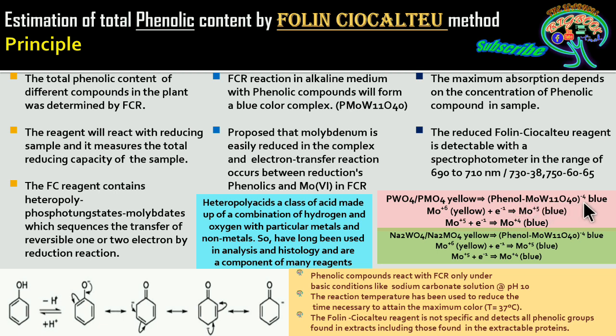In this, the molybdenum is going to transfer the electron to give the blue color to the reducing component or the sample. Now further, it is also the sodium tungstate and sodium molybdenum complex. They are the FCR reagent. Here also the molybdenum is going to readily give the electron transfer, and it is going to be reversible between the reducing component or the sample and the FCR.